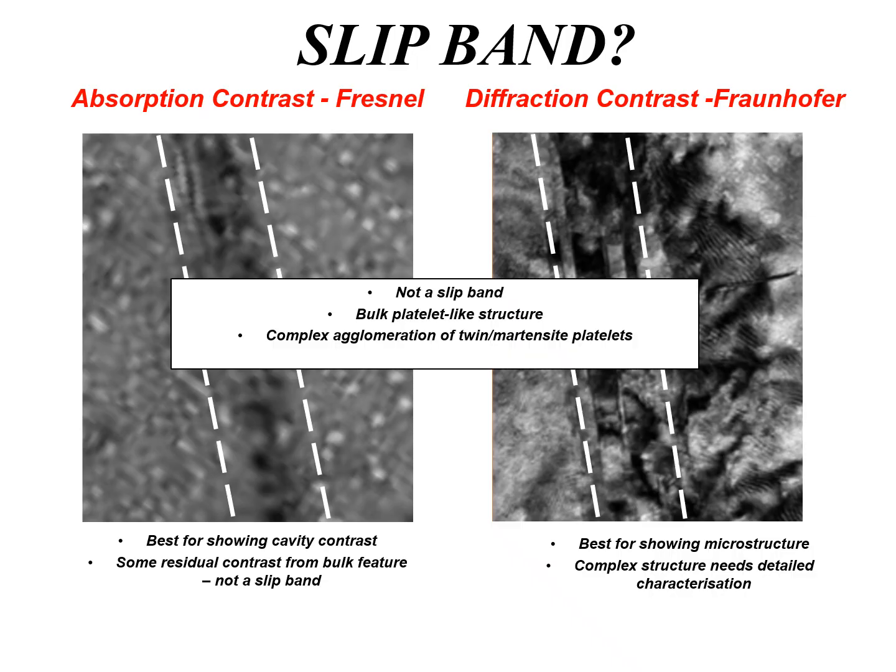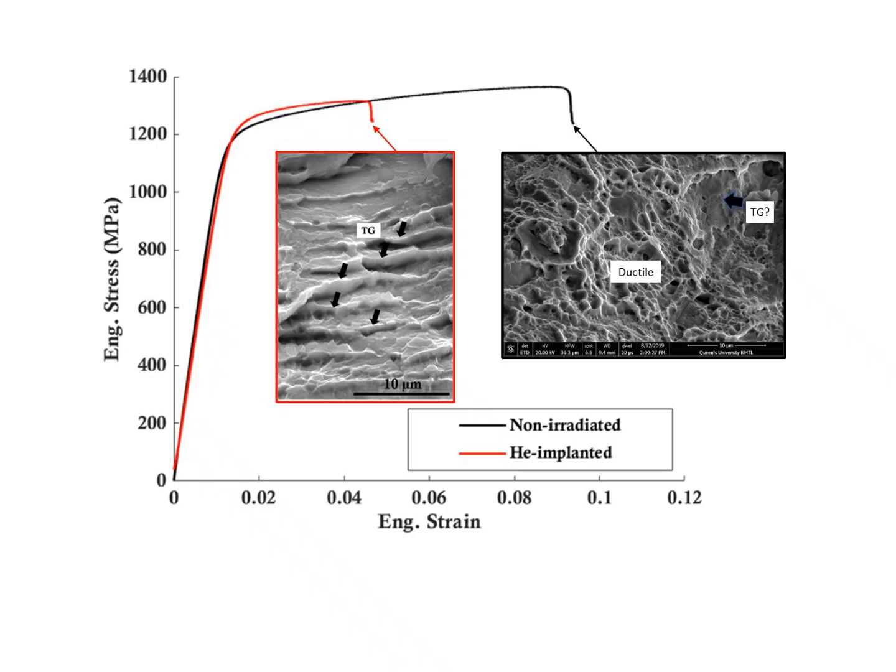So not a slip band. And that cost me a lot of ridicule because I said, it's not a slip band. So how do these things show up, these platelets?